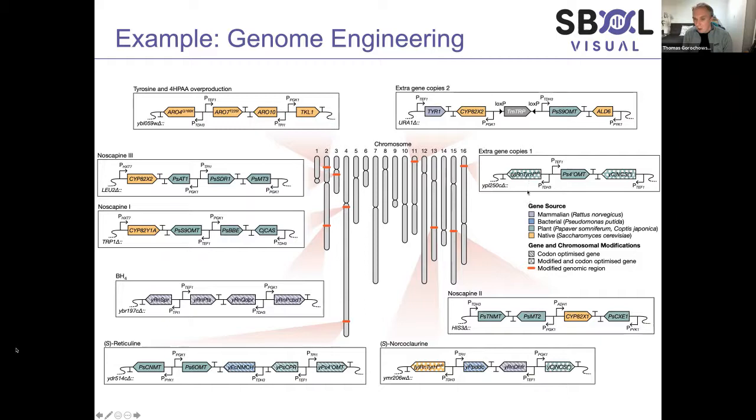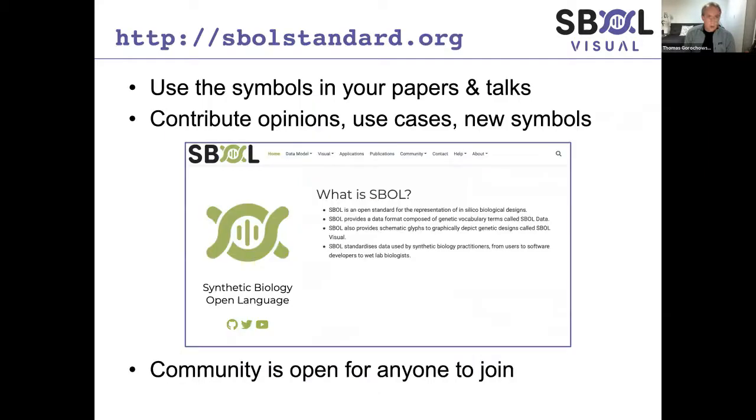And then there are some which are codon optimized, so you can see these striped white genes. And then you have these polka dot genes, which have also been modified. So it helps you really understand which bits are maybe completely synthetically coded and which bits aren't, and how you can use styling to help get across some of that information.